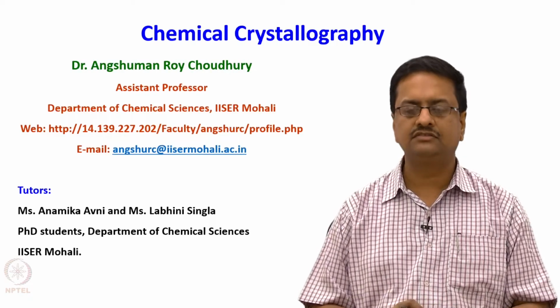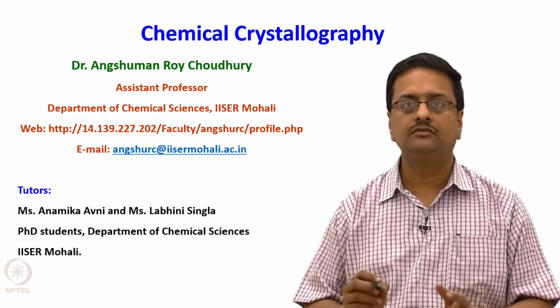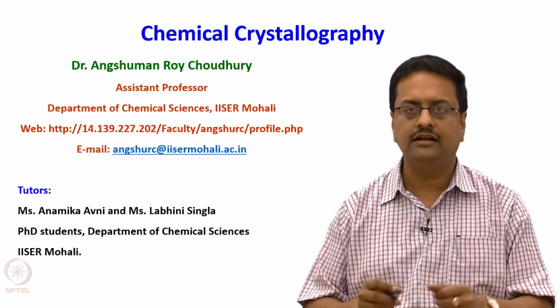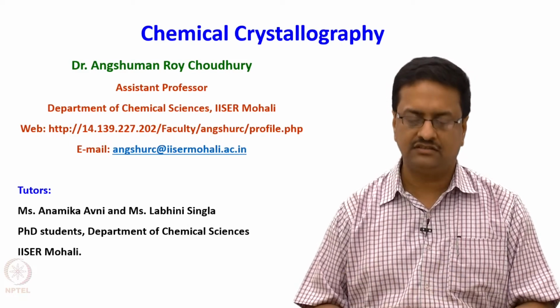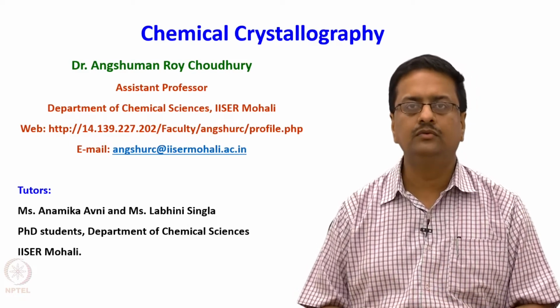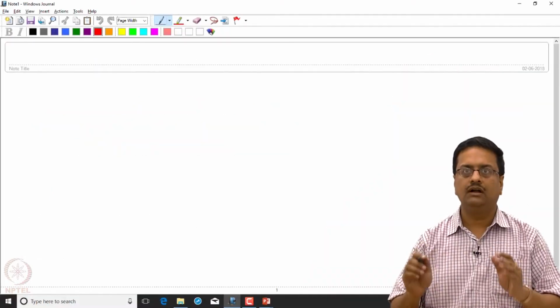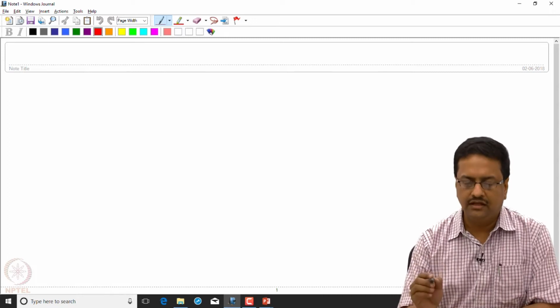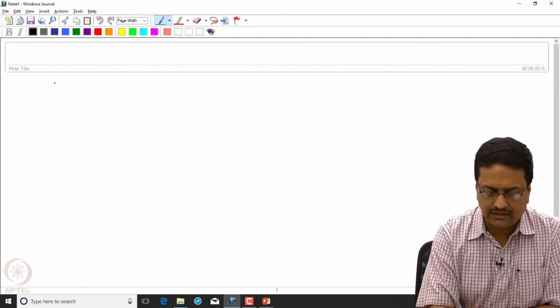Welcome back to this course of chemical crystallography. We have learnt about the data collection and data reduction methodologies in the previous couple of lectures, and today we will start trying to understand how one can solve structures using different methods. So what we have done till now is we have learnt how to do a data collection.